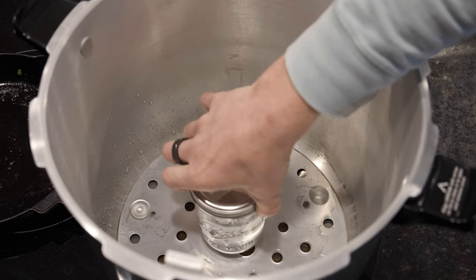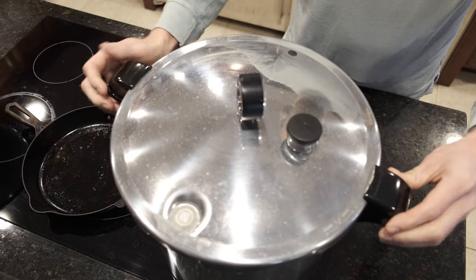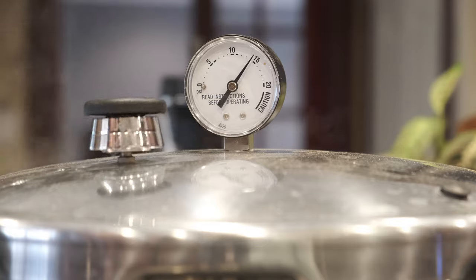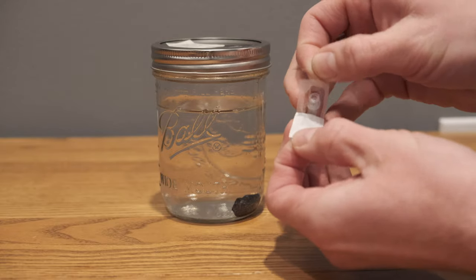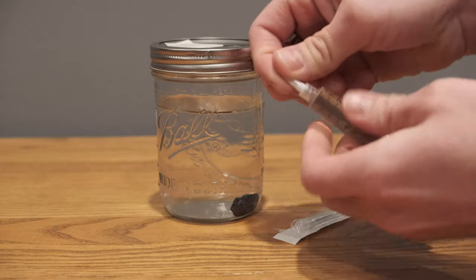We only need to pressure cook for 15 minutes at 15 psi. I've noticed that when I go longer it starts to crystallize all of the sugars that I've added, which is not a good thing here. After pressure cooking is complete I allow the solution to cool all the way down to room temperature, and then it's time to add my spores.